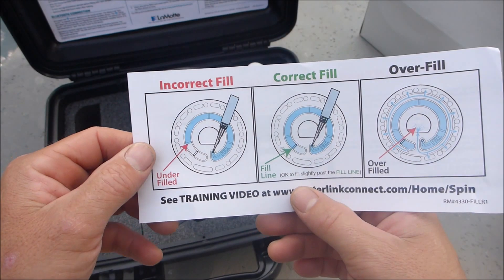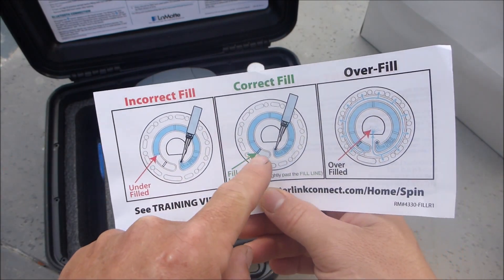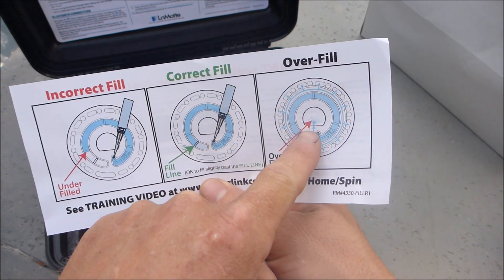It's very easy to fill the disc. You can see here that this is incorrect — it's underfilled. This is correct. And this is overfilled and water will spill out.